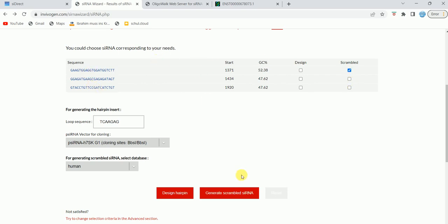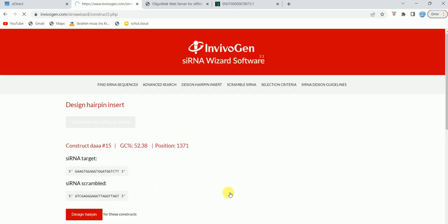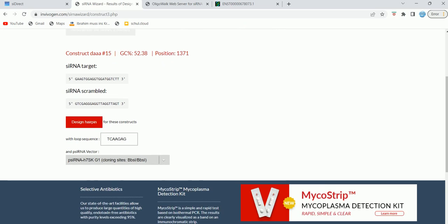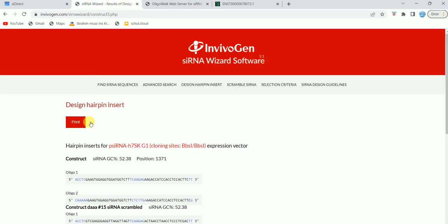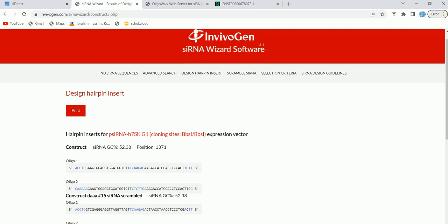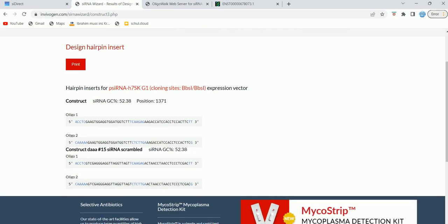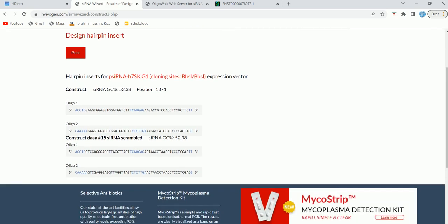You can see siRNA target is this and the siRNA scrambled is this one. We can also design the hairpin for the same sequence. Click on design hairpin and we will also get the hairpin sequence for the same siRNA. It's very useful, guys—this is a very useful tool.